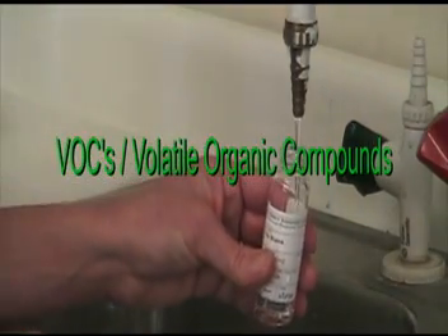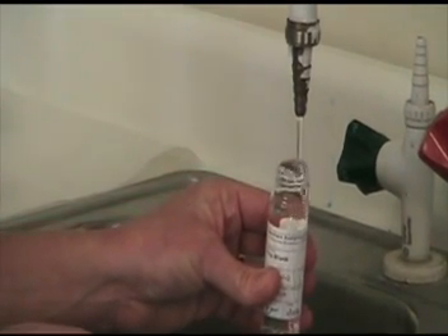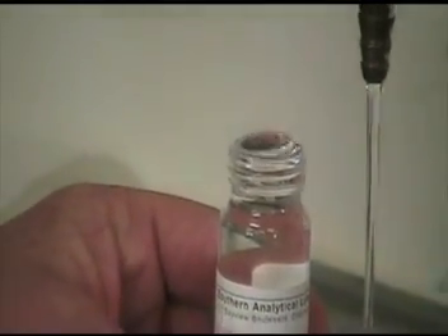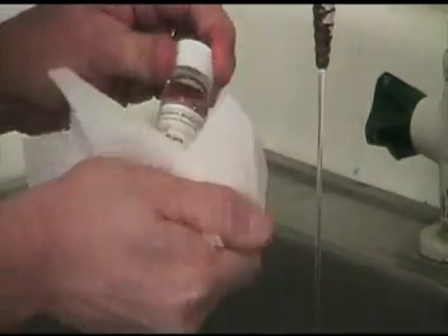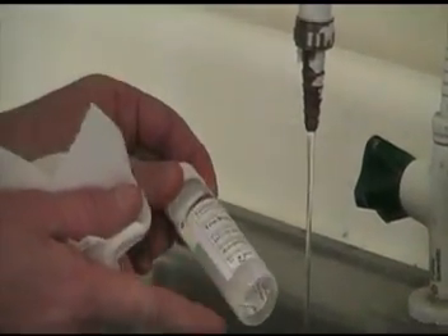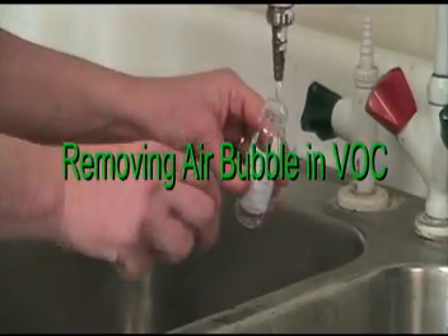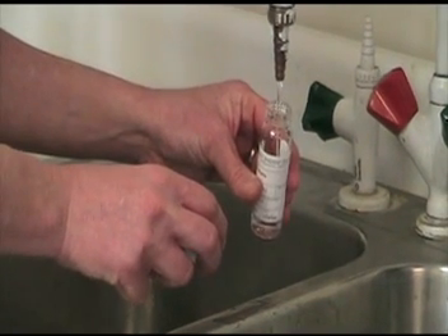To fill a VOC vial, simply fill to just over the top of the vial and cover securely. Check to make sure you have no air bubbles by turning upside down. Keep at 0 to 6 degrees centigrade in transit to the lab. After filling your VOC vial with sample, replace cap and turn upside down to see if there is an air bubble.